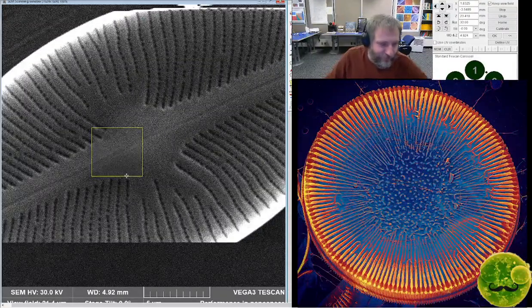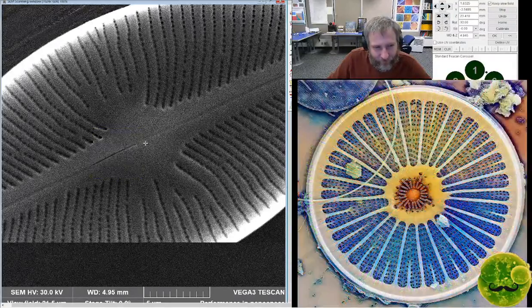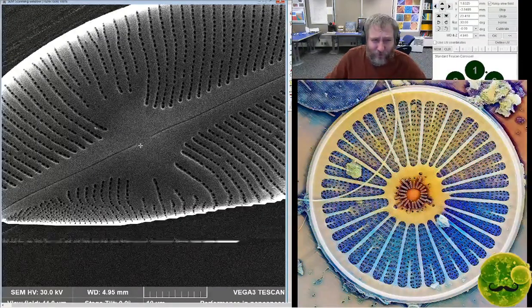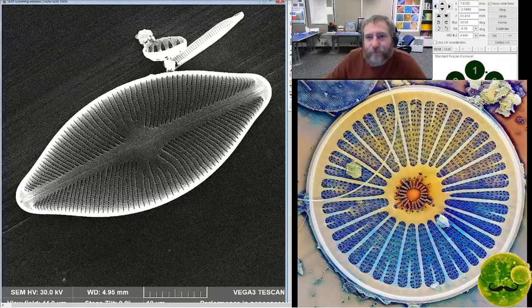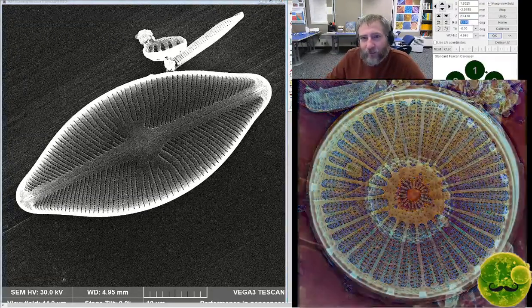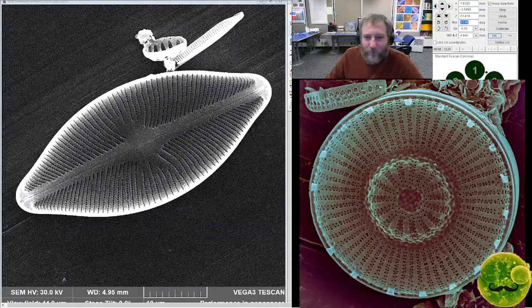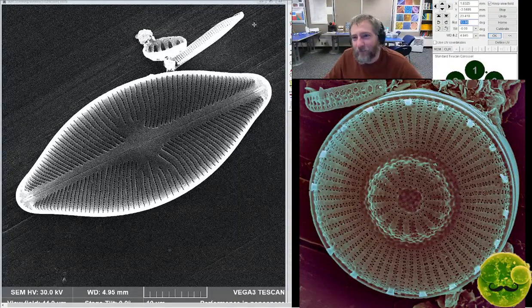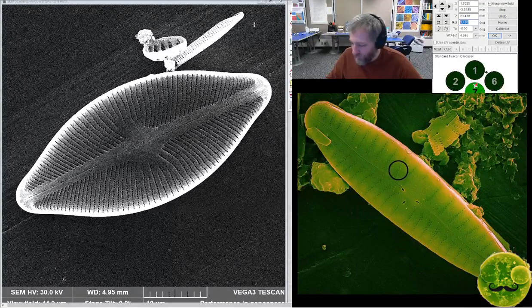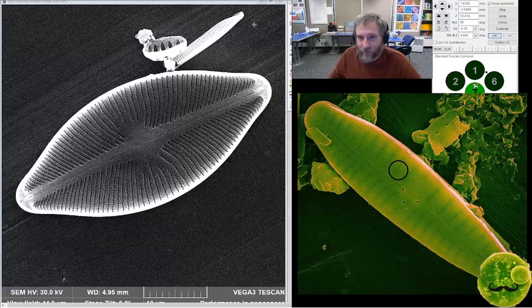Lake Malawi and Lake Tanganyika are where these samples are from, and they're filled with really amazing diatoms. There's really nobody besides me and a few other people that are really exploring them very much in terms of taxonomy. There's not that many diatom taxonomists out there, and I barely qualify as one, to be honest. I mean, I qualify, but it's not my primary focus. I'm mostly a paleoecologist, so.